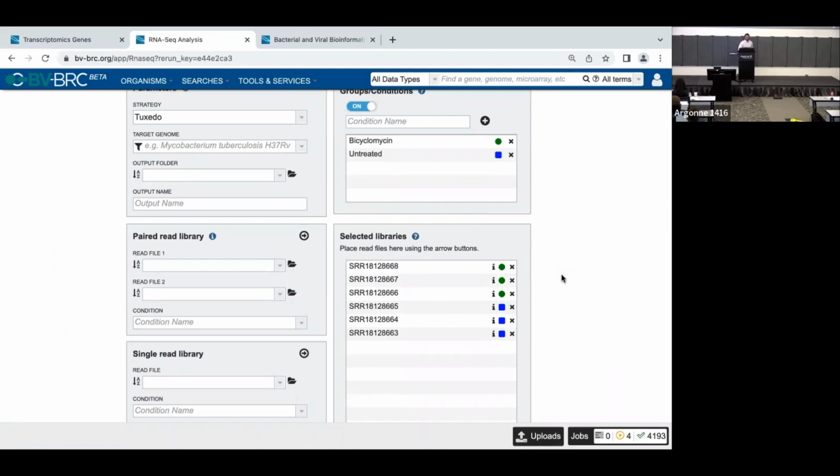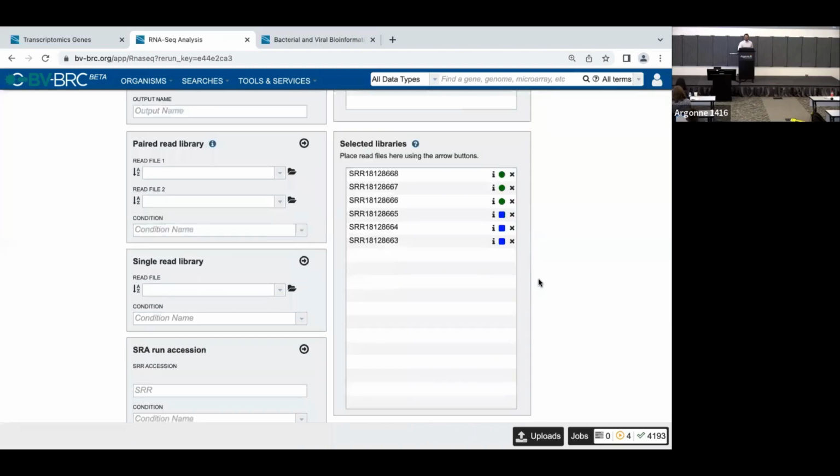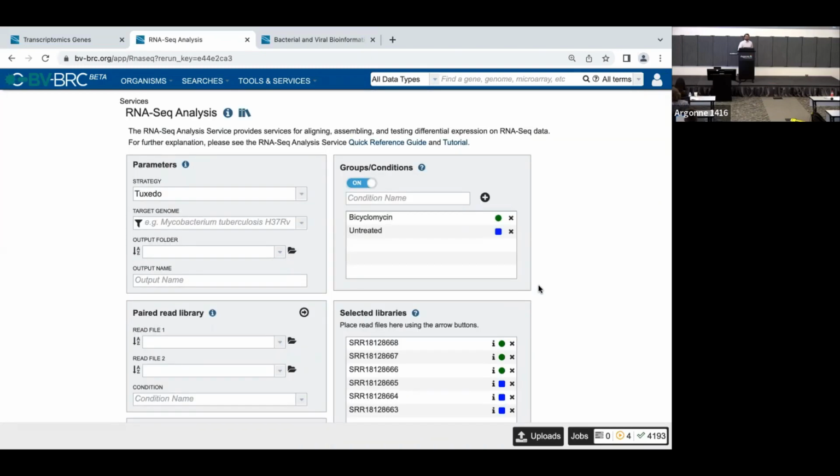This is especially useful if you've gone in and added hundreds of things and you forgot you needed one more, but you'd already started it. Or maybe it had finished and you don't want to load all of those again. So that way it will do it for you. If you have done some analysis and you want to redo it at some point, then you can just run the whole job again without going through the whole process of selecting your files and parameters and all.